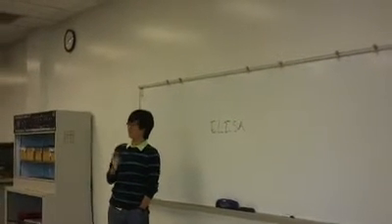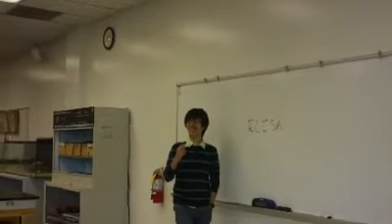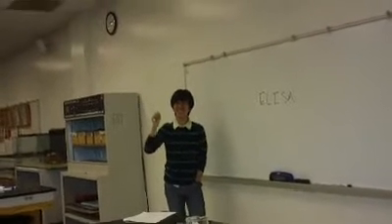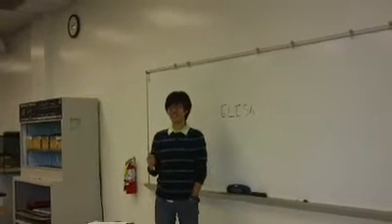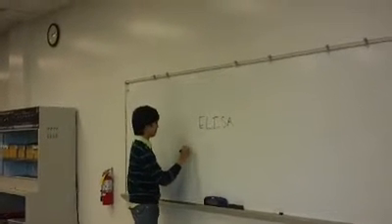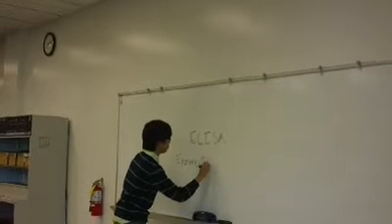Does anyone remember what it stands for? Enzyme, linked, and similar. You got the first two. Well, I read it on the cheat sheet. Go ahead. Enzyme linked immunosorbent assay. All right, so let's dissect what this means, because so far it really doesn't seem very intuitive what they're talking about.